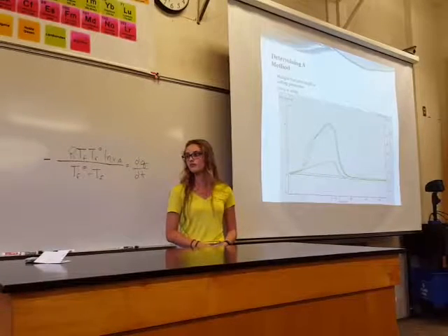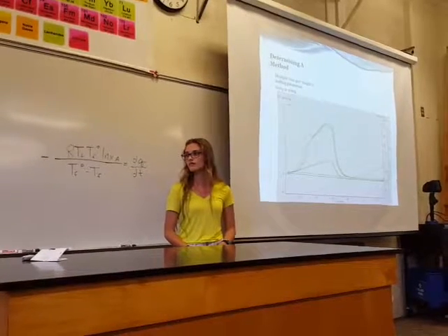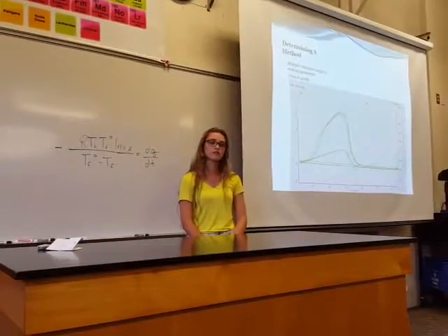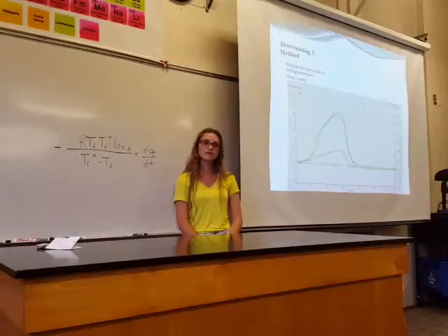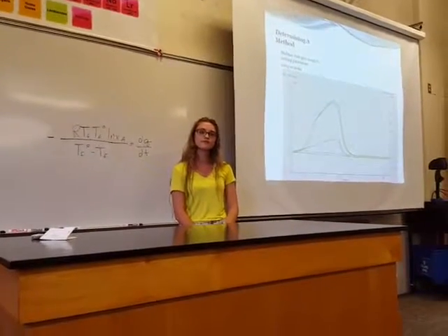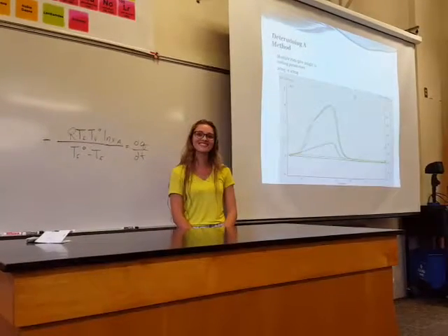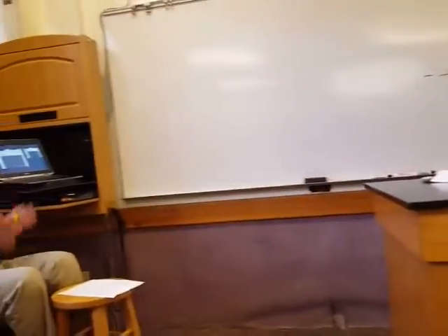Well, it would be ideal, but with all these little supercooling quirks, if the peaks get off slightly, then all of a sudden it's just a mess, right? Because it's going to go up and down. It'd be nice if here's one peak and here's the other peak and they're almost exactly the same, and then you just subtract one from the other, you see that little bit. But there's enough variability that if it gets off slightly, then the peaks no longer look the same, and your trend of what you're trying to monitor depends too much on how the machine's feeling that day. So.